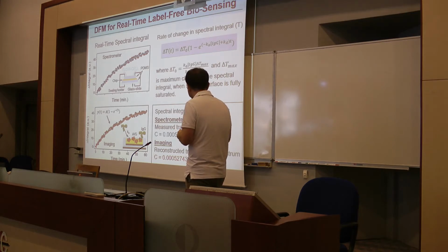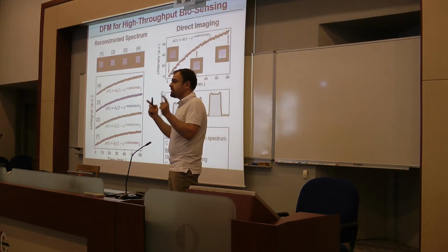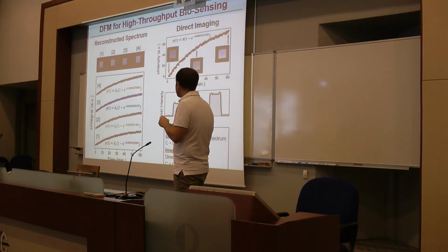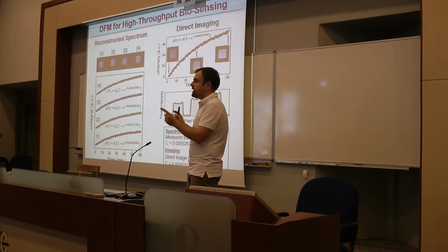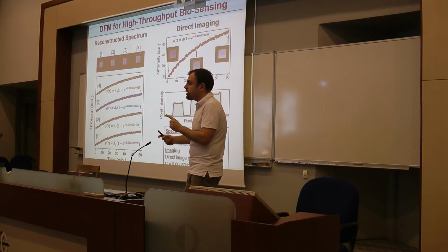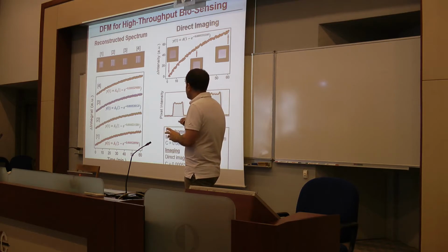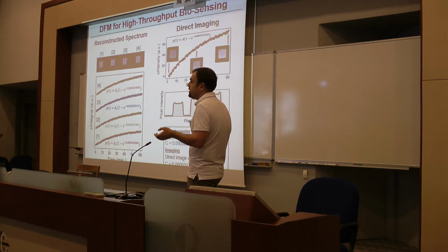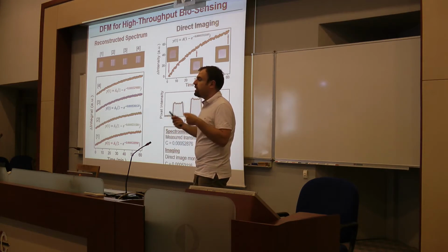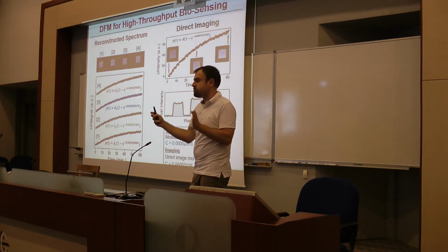like people classically use in commercial SPR platforms. And more importantly, since we are using a CMOS camera, we can perform multiple experiments all on the same platform, but in the commercial SPR platform, you can only perform a single experiment. So you have to repeat the experiment. It takes maybe 3-4 hours, and you have to repeat that. But in our platform, you can perform all the same experiments many times. However many experiments you want to perform, you can define that many sensor spots on the same plasmonic chip.